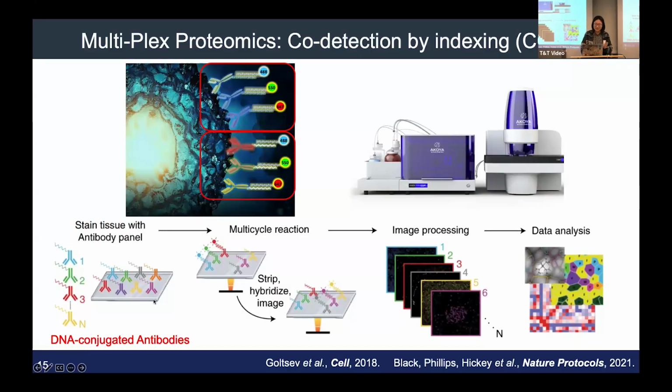Once they detect, we image the whole area by stitching specific regions at high resolution, usually 20x or 40x. And because it's a very weak binding for the DNA oligo, you can adjust the salt solution, the saline solution, for binding and unbinding. So you wash it off, and then you have another 3 different types of fluorophores binding to 3 different targets. This entire multiplex process usually takes about 4 days on the machine. And then the raw data is anywhere from 200 to 400 gigabytes, depending on how big your tissue is and how many antibodies you end up using.